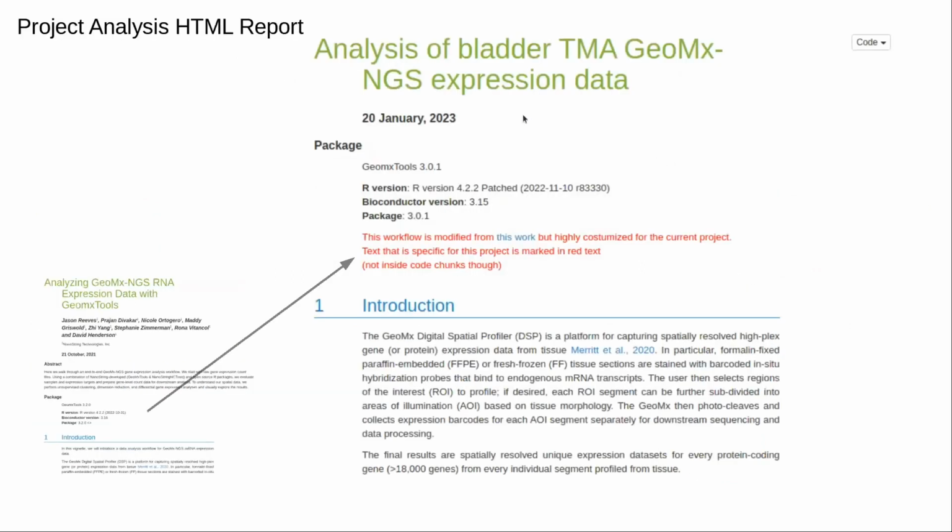Okay, so that was how the count matrix or the count files are made. Now I want to talk a little bit about what we do when we have the count files and start doing further analysis of the counts.